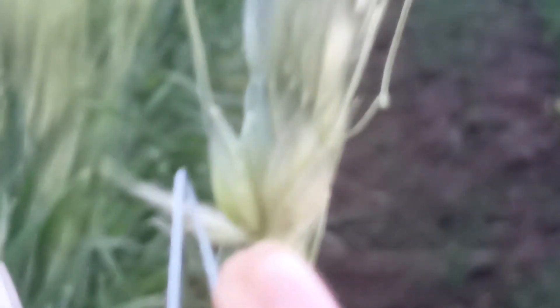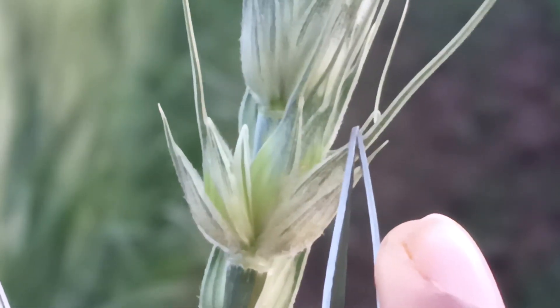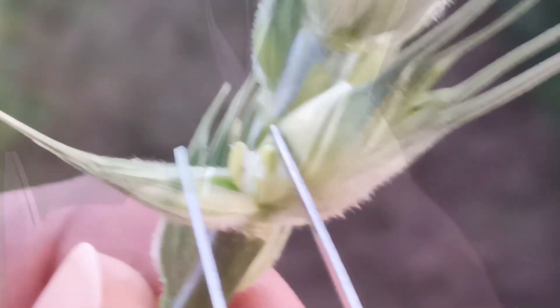Here you can see the glume on both sides of the spikelet. This is the primary floret, this side is the secondary floret, and in the center there is the central floret which is sterile. You can see three anthers here.